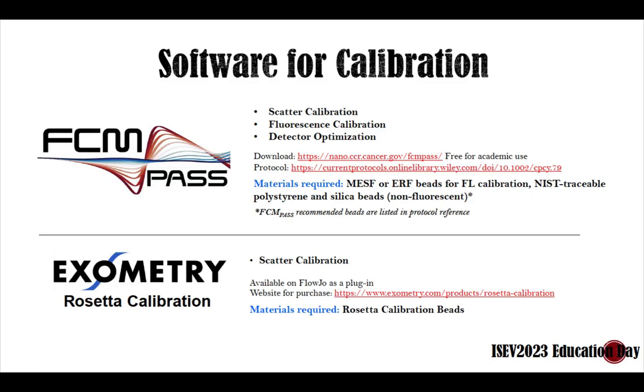So there are 2 separate software packages that I'm familiar with. One is FCM Pass, which is free for download for academic users. Protocols are available online, they're published. You do need to buy some materials, the calibration materials, and they are listed. So you may need your MESF beads in the case of FCM Pass, and your NIST traceable sizing beads. All of this is information on these websites.